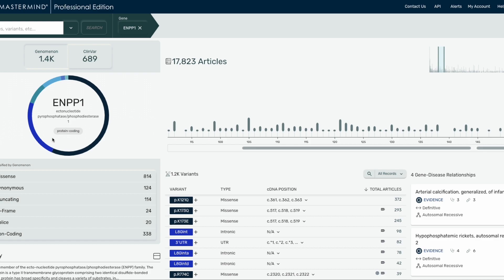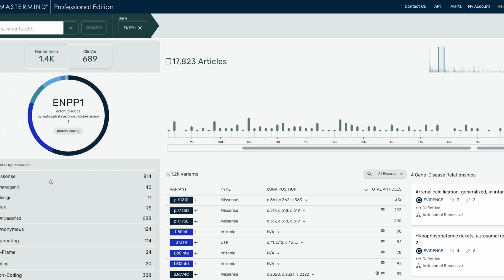On the left-hand side, the new variant circle graph shows you the total number of variants in Mastermind and the total number of variants submitted to ClinVar for that gene you've searched. Below the circle graph, we show a color-coded breakdown of variants by type. Within each variant type, we also show a breakdown by classification which you can view by clicking on the variant type. All Mastermind users can view the total number of variants by type and classification breakdowns for some genes, while Pro users will be able to see the type and classification breakdowns for all genes.